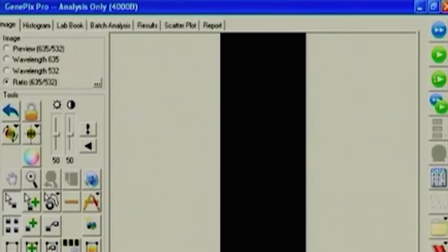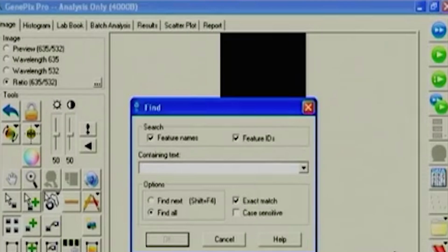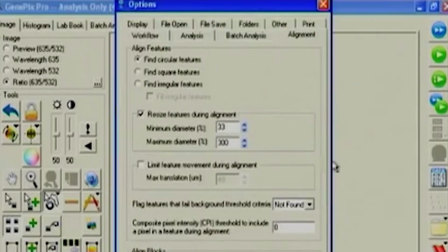And this one is actually for flagging. As we discussed, the different features can be flagged. Once the image is available to you, you can look at good, bad or absent, and you can give them different ratings. Here again are different zoom buttons, which allow you to focus on feature names or the feature IDs where you want to go to one particular one. The major one here is particularly this, which allows different workflow controls, right? So this allows different ways to be handled.